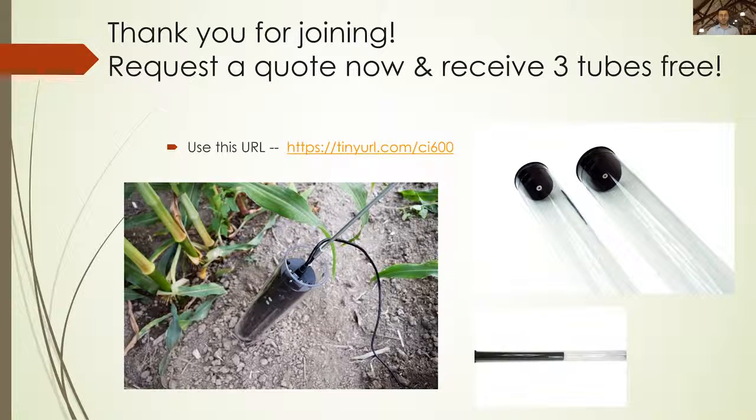The next question is, what does the tip of the tube look like? Gesturing towards the screen, you can see we have insulation caps on both ends, and you see the larger diameter for the 600 and the smaller for the 602.